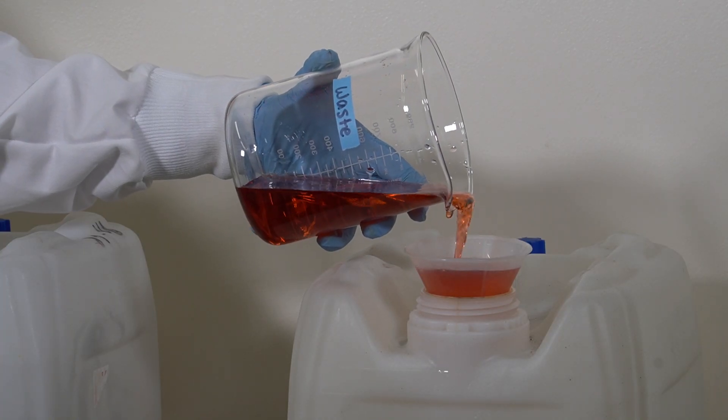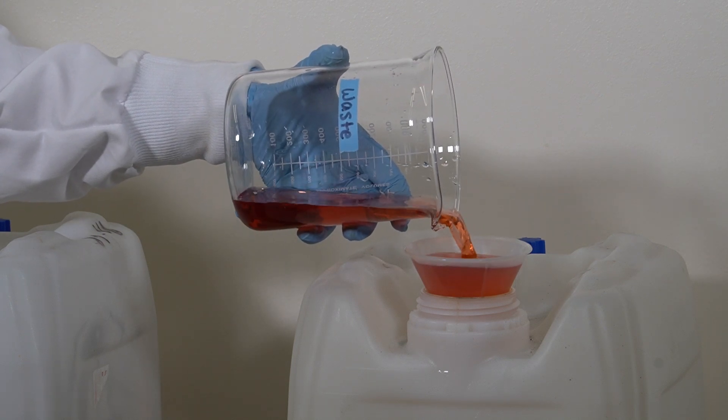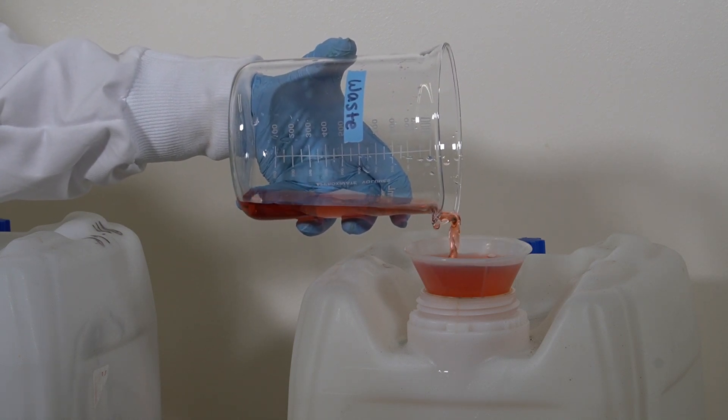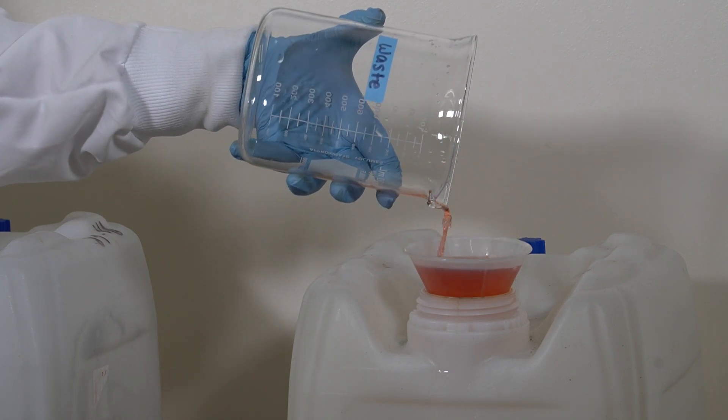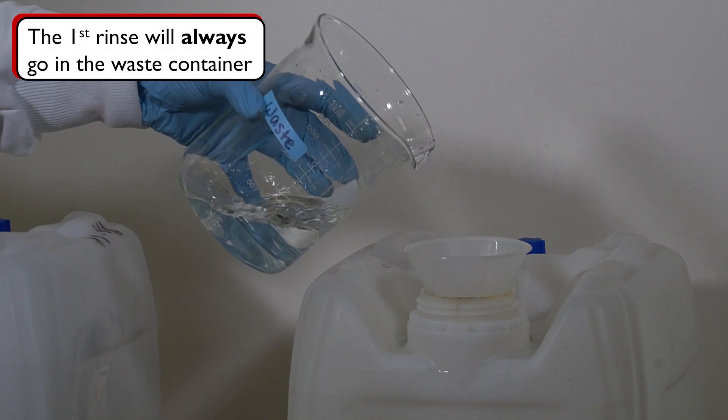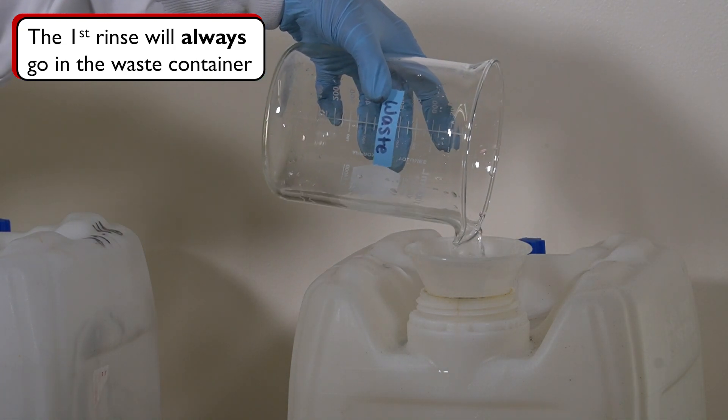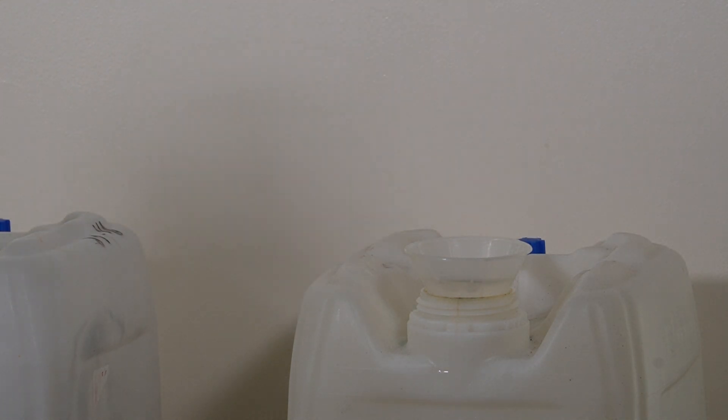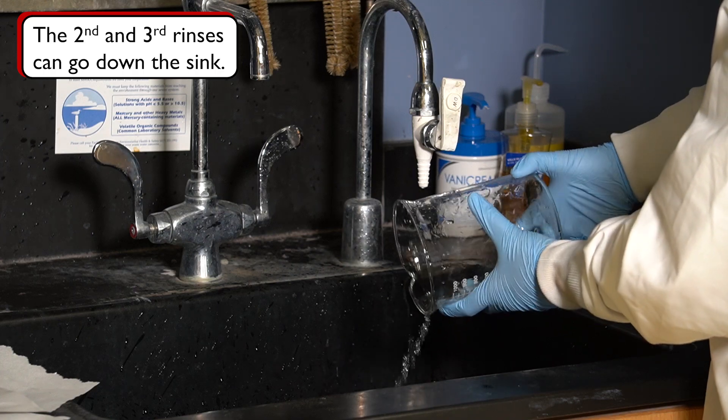At the end of the experiment, you should always remember that a temporary waste beaker needs to be cleaned. Make sure to empty the waste beaker completely and rinse it with small amounts of DI water 2-3 times. The first rinse is also waste and must be disposed of in the waste bin, while the others can go down the sink.